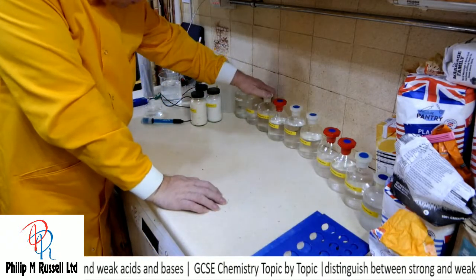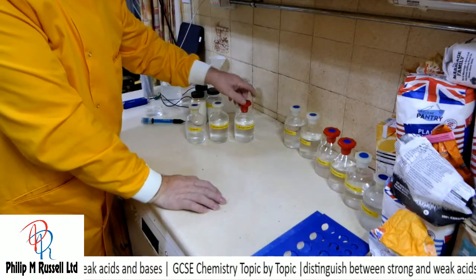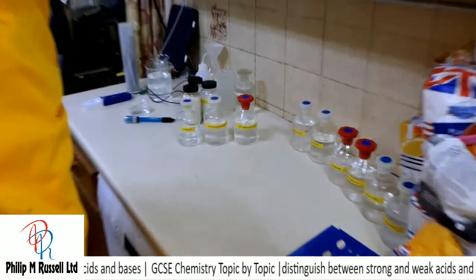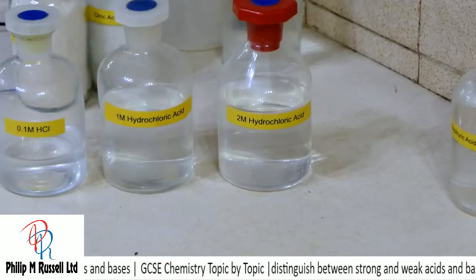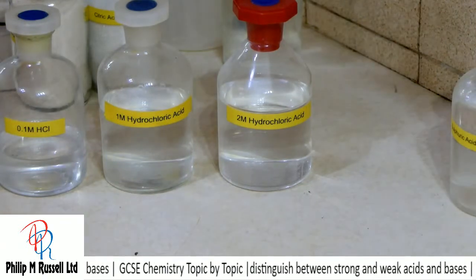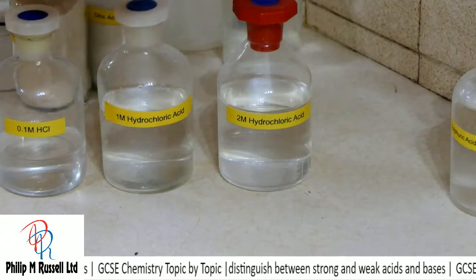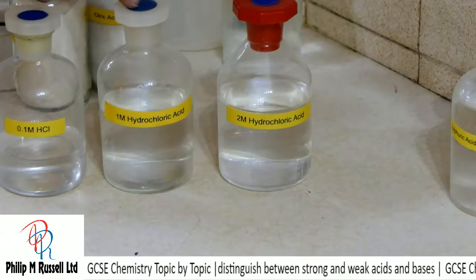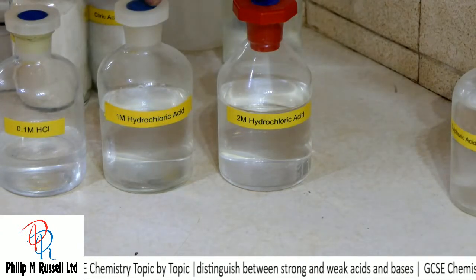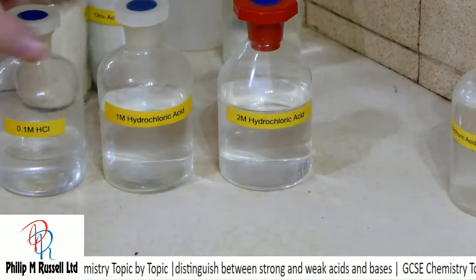I've got 3 acids here, and they're all the same. Let me zoom in. I've got 3 different concentrations of hydrochloric acid: a 0.1 molar, a 1 molar, in other words 10 times as strong, and a 2 molar, which is a standard sort of solution.